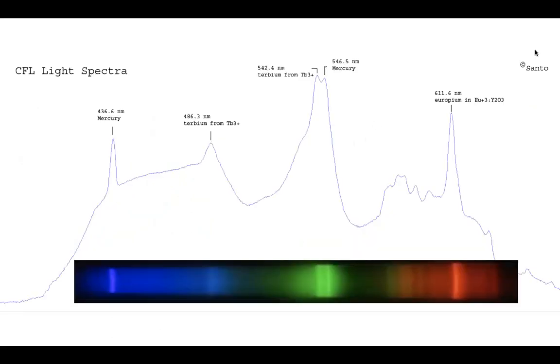Do we have any more questions on how the spectrum works? Yeah, Iqbal, for this one, do we need to know the light source, the intensity of the light source we are using? No, in this case, since we are taking two different spectrums, one of the sample and one with regular water, we will basically do a ratio, so we don't need to know the intensity.